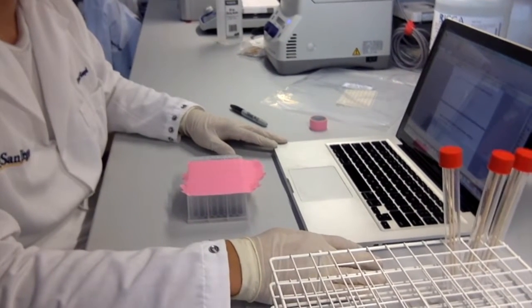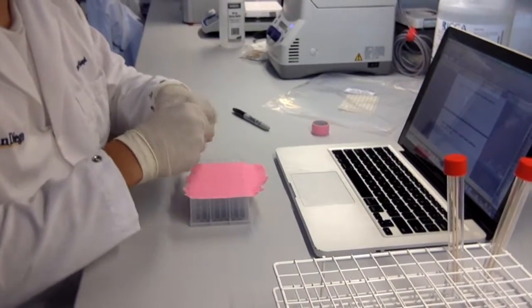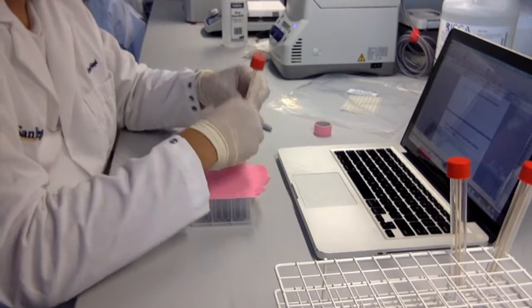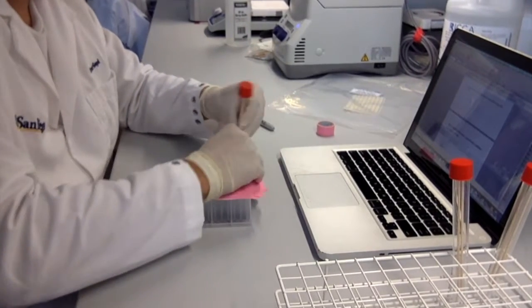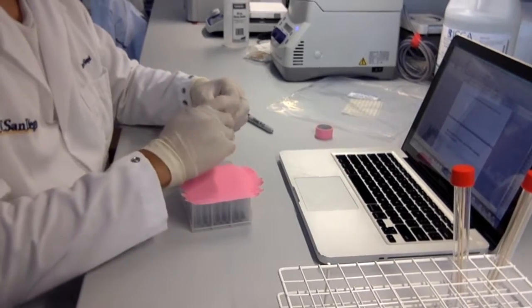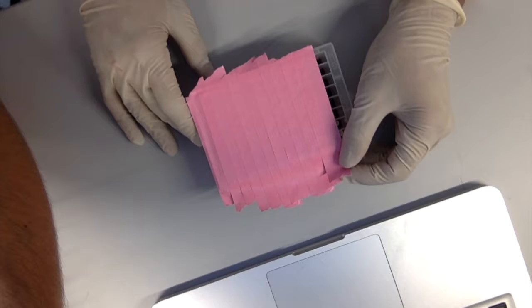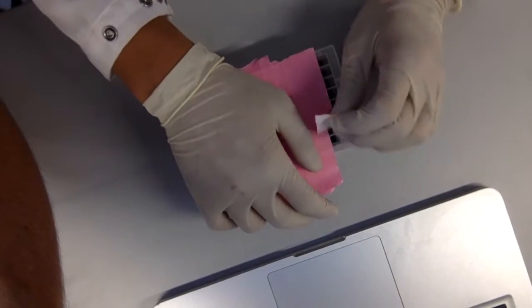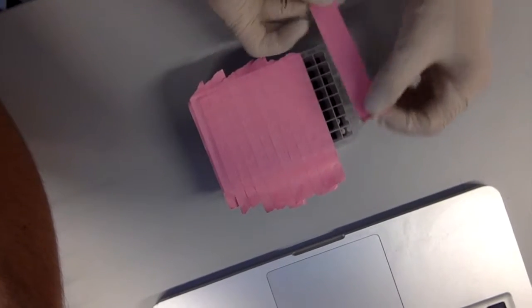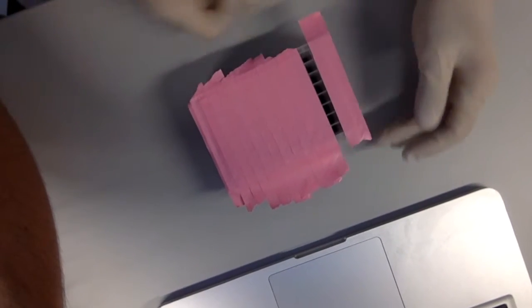Step 11: Repeat this for all of column 1, row B through H, grabbing a new swab for each well. Step 12: Remove the tape from column 2 and cover column 1 so that only column 2 is open. Repeat steps 8 through 10 until the entire plate is complete.